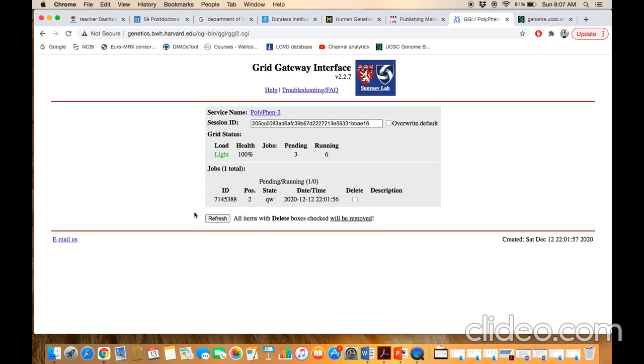You only have to click on the refresh button and the page will be refreshed. It will show whether your result has been generated or not.